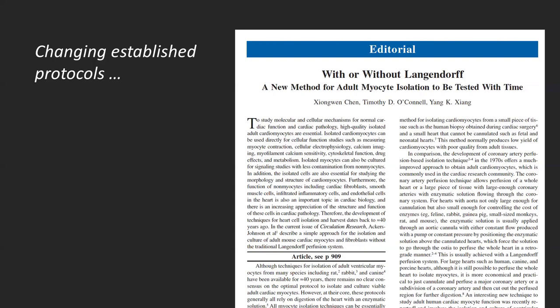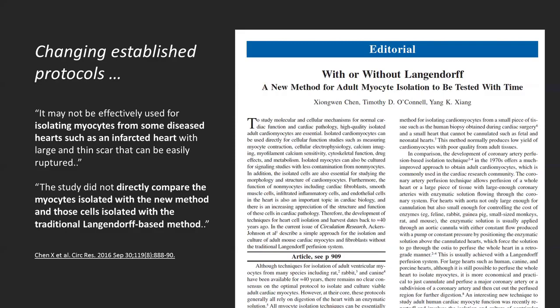And there were a couple of questions that the authors of the editorial asked. One was whether this method would be effective for isolating myocytes from some diseased hearts, such as an infarcted heart with a large and thin scar that can be easily ruptured, as you're obviously introducing quite a lot of pressure through the left ventricle. Would such a technique be feasible with infarcted hearts? And they also asked for us, or maybe other people, to do some direct comparisons between the myocytes isolated with the new method and those cells isolated with the traditional Langendorff-based methods.